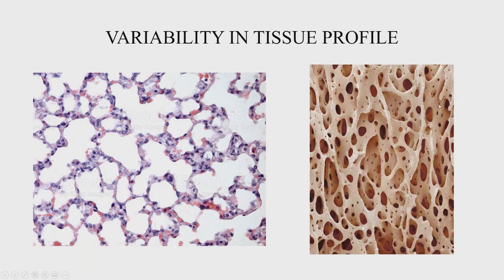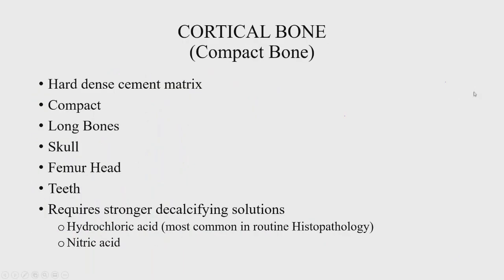On the right, you have a different type of bone specimen. It looks more petrified, almost spongy, something like petrified sponge. But this also is something that in some kinds of bone diseases doctors might want to look at, and we have to be able to section that into micro-thin sections, 4 or 5 microns, preferably 4, so that the doctor can see this at a cellular level.